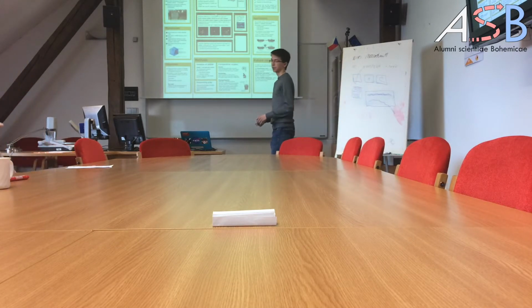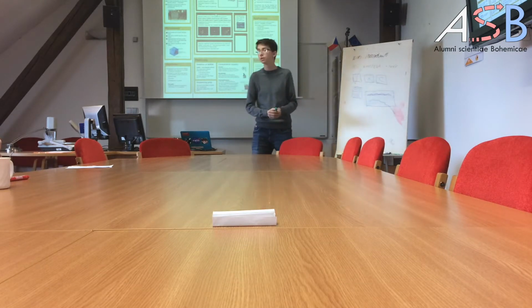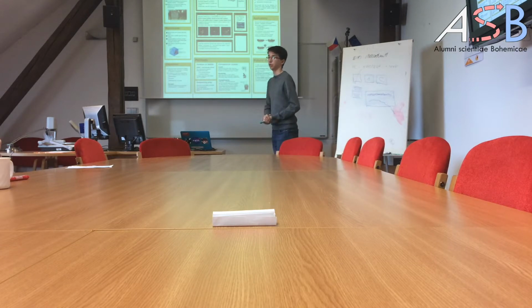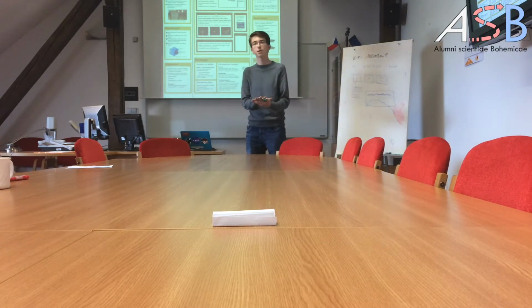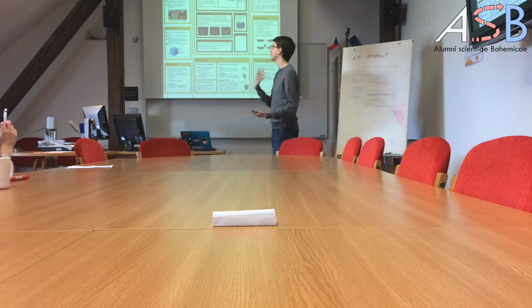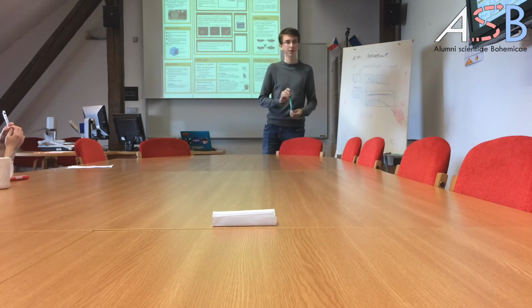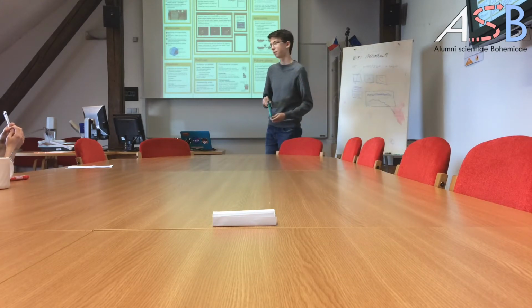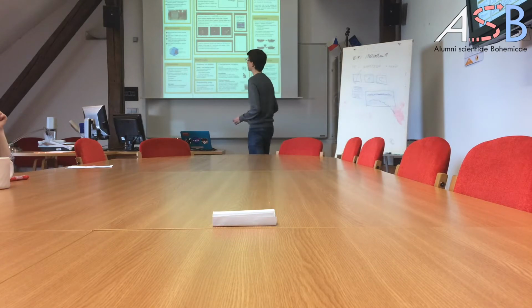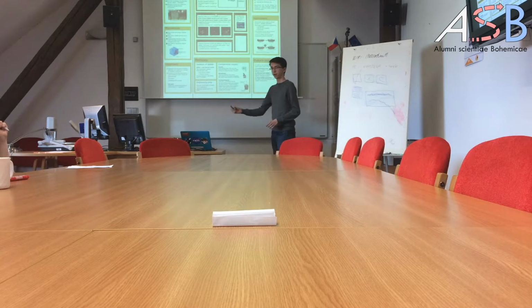And these fungi were compared in terms of growth rate on general medium, and morphology. That means how these fungi looked on petri dishes when growing, and also how they looked under the microscope. The most important test was carried out on plants. It was a test of phytopathogenicity, the ability of the fungi to infect the plants and cause disease in them.